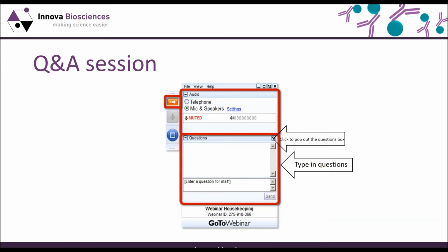And the last question, can I use my antibody oligoconjugate for a technique other than Immuno-PCR? Yes, you definitely can. Antibody oligoconjugates are ideal for Immuno-PCR, but they also are regularly used for assays such as proximity ligation or proximity extension. Those techniques rely on the use of two oligoconjugated antibodies against different epitopes of the same protein, or against two biomolecules which can interact with each other. When both antibodies are bound to their targets and they're close together, the oligos hybridize and you can then amplify the DNA and detect it.